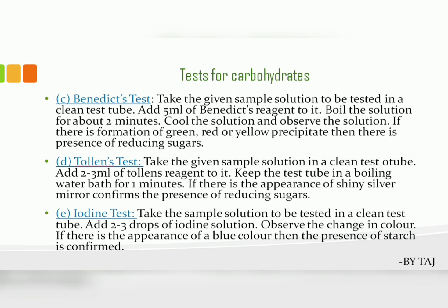Another test is the iodine test. Take the sample solution to be tested in a clean test tube. Add 2 to 3 drops of iodine solution and observe the change in color. If a blue color appears, the presence of starch is confirmed.